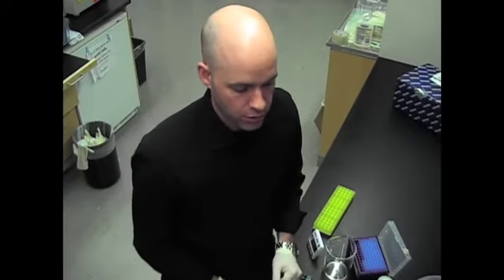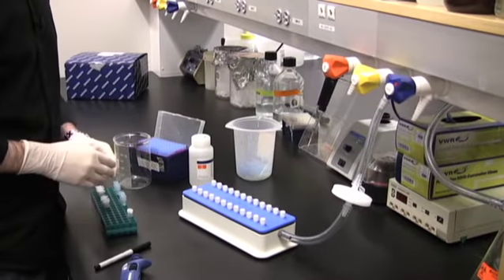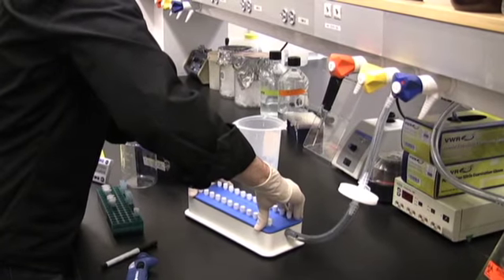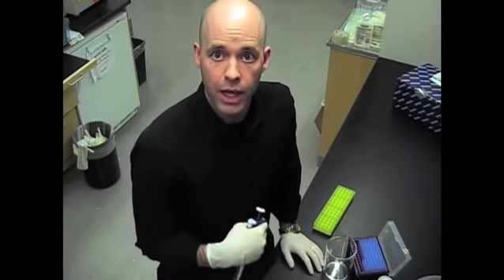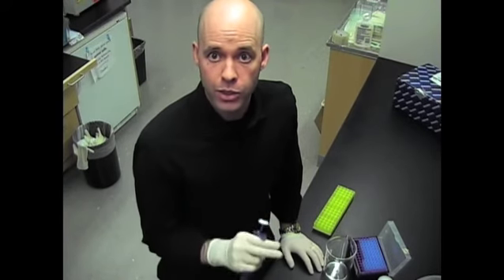To prep the vacuum manifold, first you want to turn on the vac, and then you're going to want to push down on the lid until you hear it seal. If there's a tight seal, you shouldn't hear any leaking. Now we're going to start the timer and look at how quickly we can go from this step — having the lysate — to actual purified DNA.